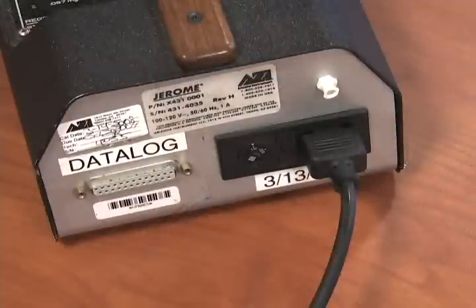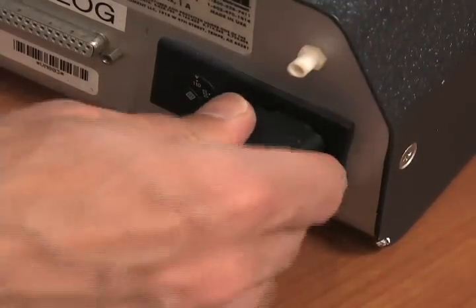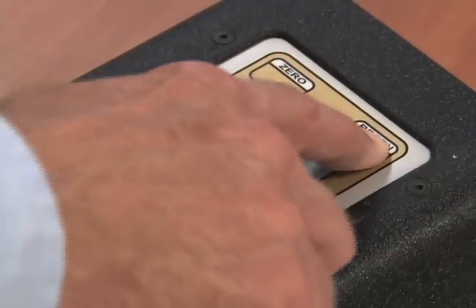You should regenerate the sensor prior to starting your survey. First, push the on button to turn the unit on. Attach the charger cord to the unit and plug it in. Push the regen button. HHH will be flashing on the screen.